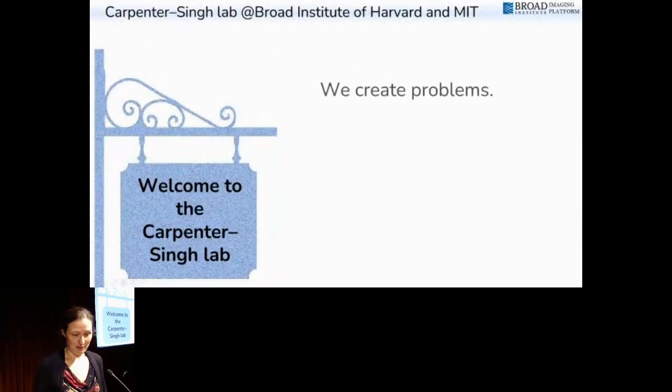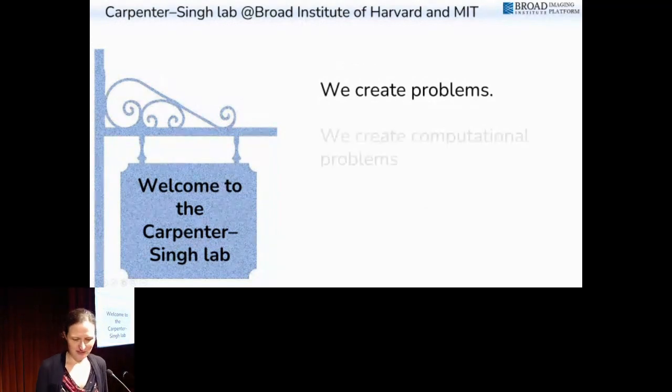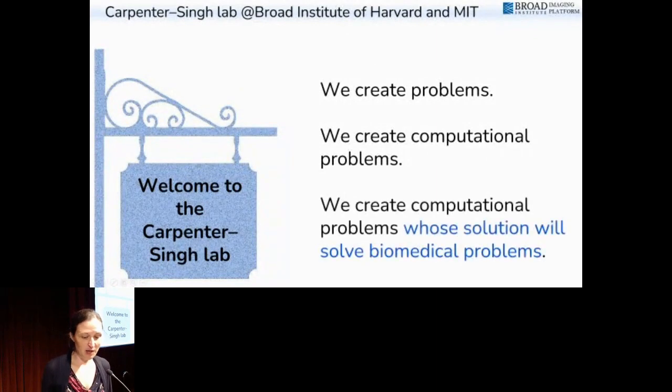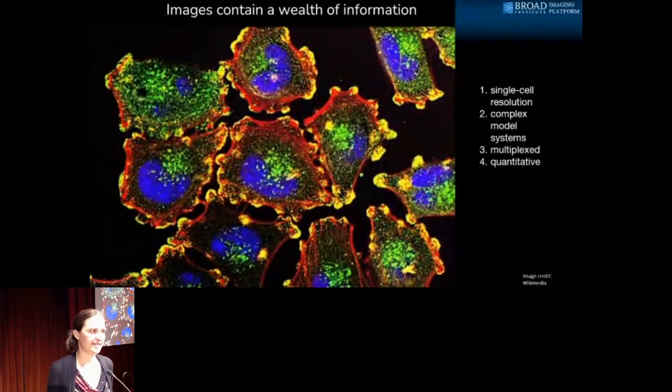In my lab, which is co-run by Shantanu Singh, we cause problems. No, we create problems. Specifically, we create computational problems whose solutions will solve very big biomedical problems. So our mission is to facilitate basic biology research, but also drug discovery. And to do so, we're really focused on images as a data source.